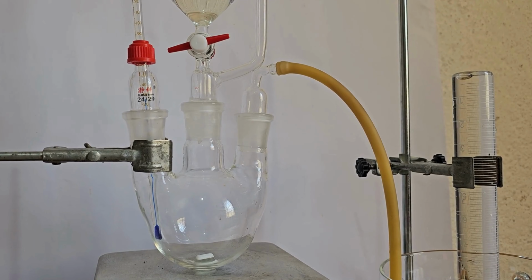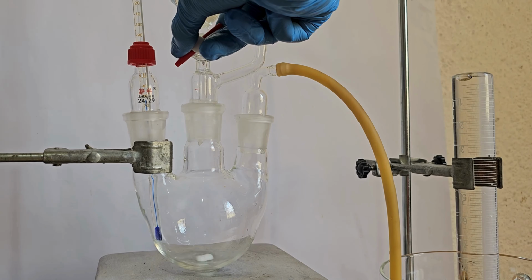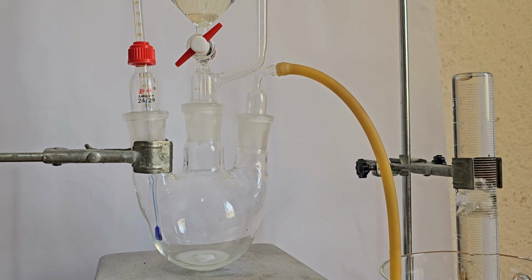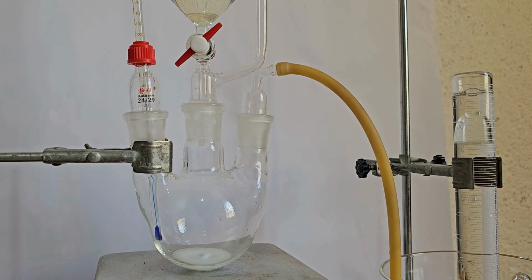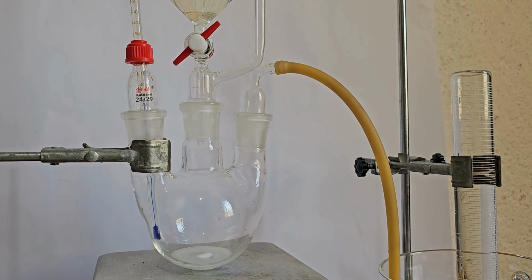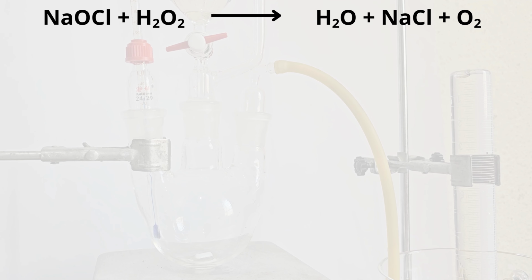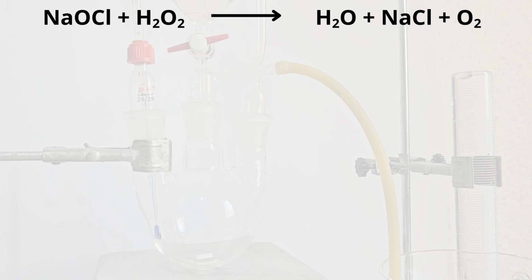In the addition funnel we have 3% hydrogen peroxide, and in the round bottom flask, 1 milliliter of sodium hypochlorite. Slowly start dripping the hydrogen peroxide into the sodium hypochlorite, and oxygen gas will start generating. Based on the volume of air displaced, we can calculate the concentration of the sodium hypochlorite solution. The reaction goes like this. Hydrogen peroxide and sodium hypochlorite react to form water, sodium chloride, and oxygen gas.